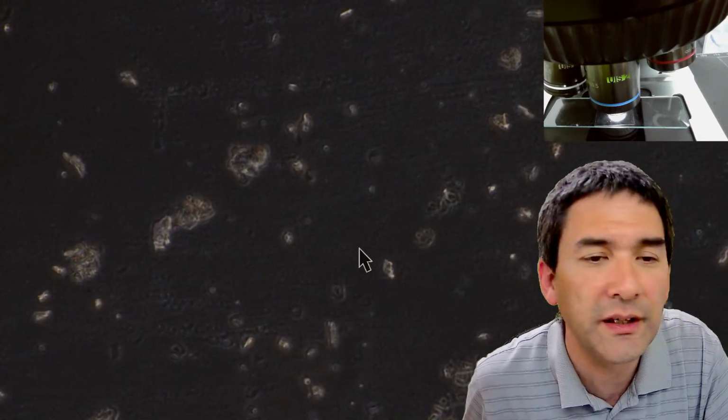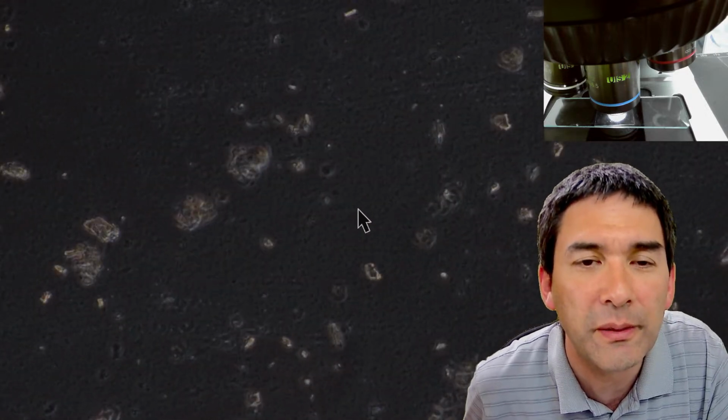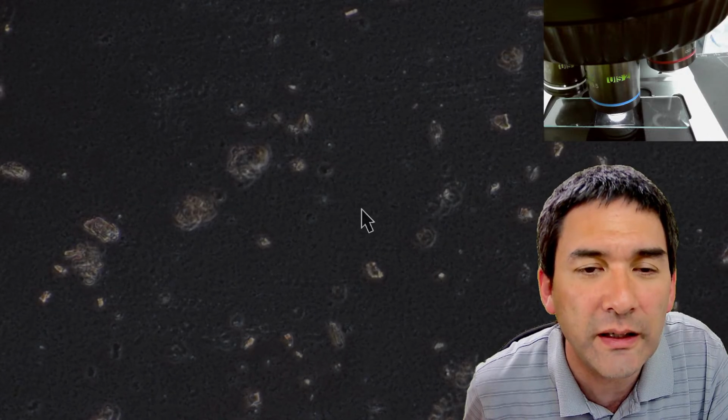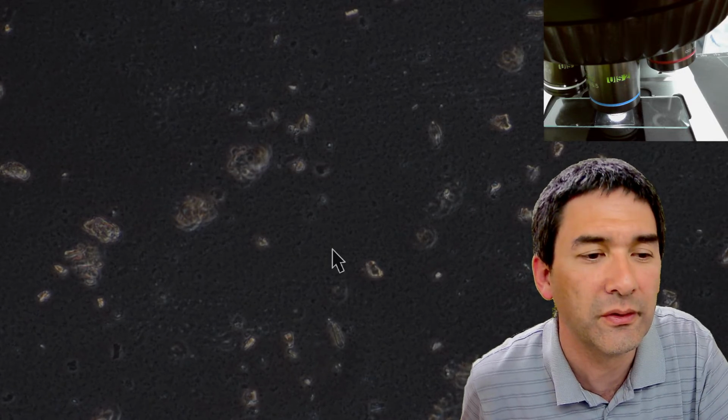The liquid is spreading now. So all of those tiny dots in the background, these are the bacteria. So again, this is directly the powder, and not very impressive.